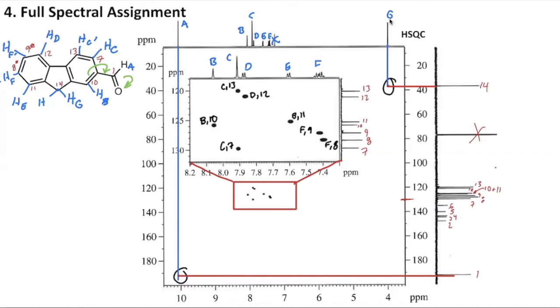So we're pretty much there, right? Well, some of you maybe are wondering about the few carbon numbers down here that went totally unused. Where are those carbons? We didn't see any HSQC correlations for those, so what happened to them? They didn't just disappear. If you look on our structure, you'll be able to probably note a couple of places where we haven't filled in any carbon labels, specifically at these positions here, which are all quaternary carbons.